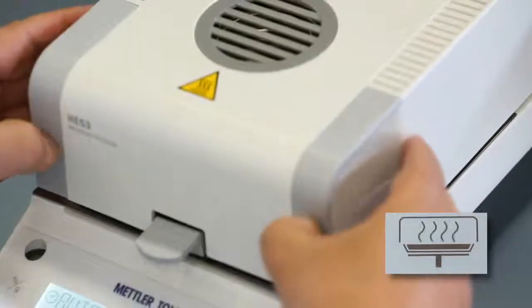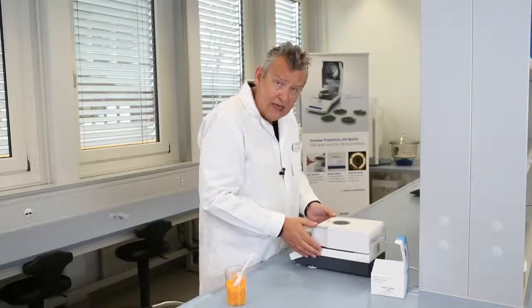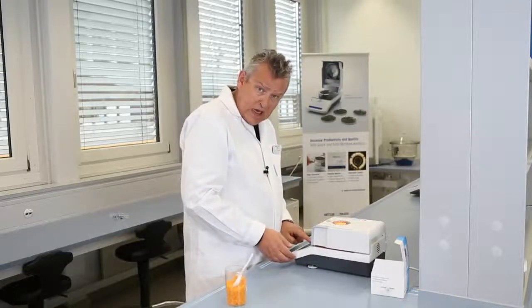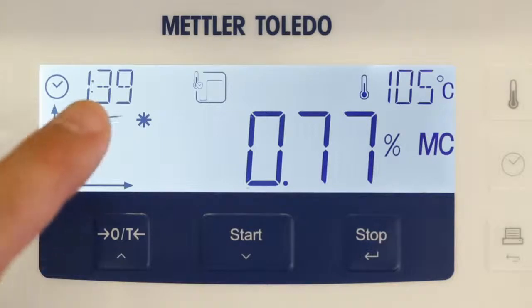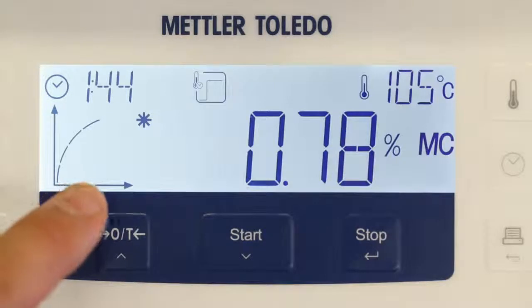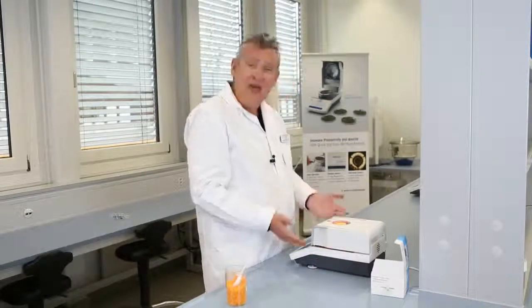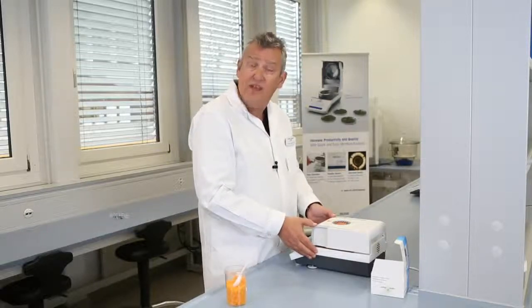Close the lid and press start. The instrument starts to heat immediately, as you can see from the halogen lamp. Notice the graphic indication on the display. You can see the current moisture content, the elapsed time, the current drying temperature, and the graphical progress indicator which provides an overview of the measurement's progress. The audible beep at the end of the measurement indicates that the measurement is completed.